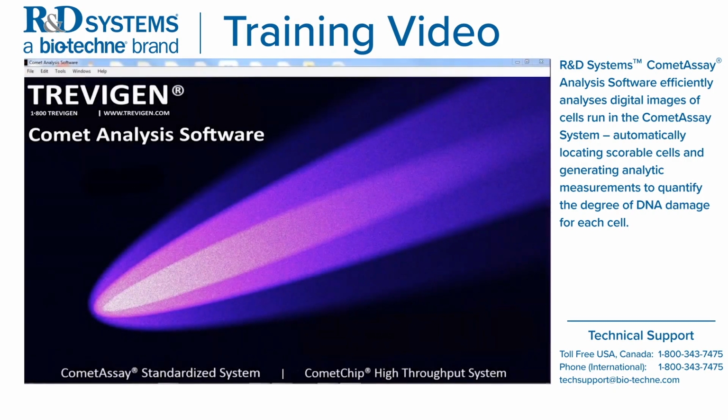This is a demonstration of Trevigen's Comet Analysis Software. The software is designed to analyze digital images of fields of cells which have been run in the COMET assay, and then to quantify the degree of damage of each cell.